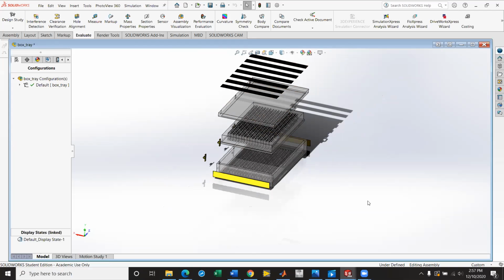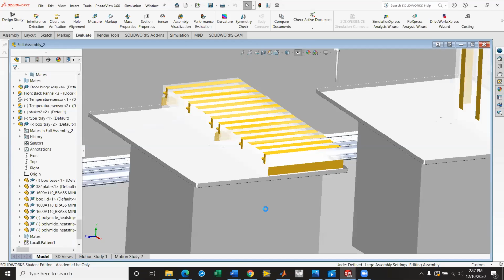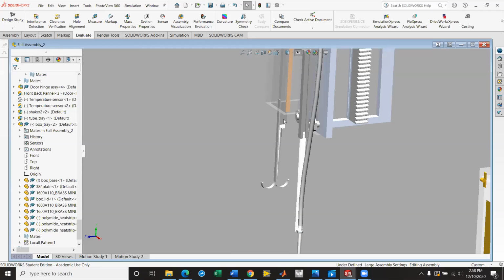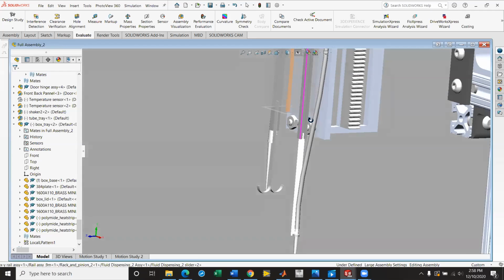The optical readings, is there any science behind how you would record those measurements and convert them to a valuable or useful number? Well, to record the measurements, we have a photodiode attached also to the fluid handler. I'm not sure if the full assembly is shown, let me show it.